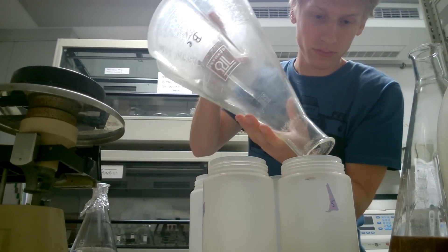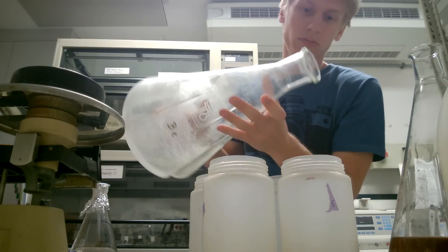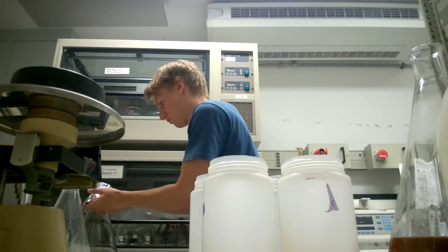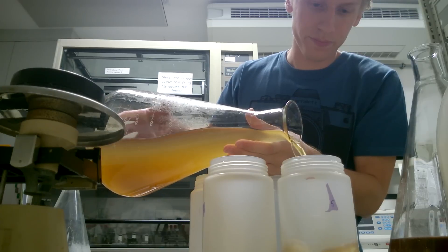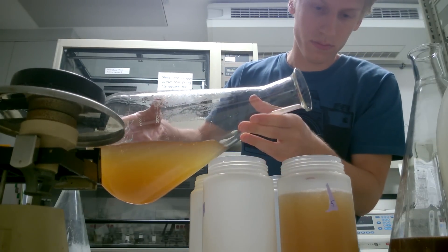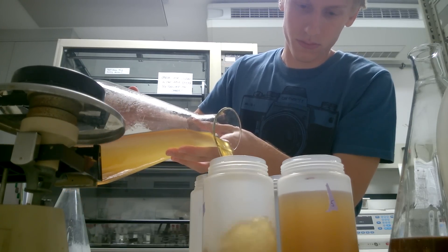That is the last little bit of culture from that flask. It was actually six flasks — it's been a week since I recorded that so I don't quite remember. You can see it's still really opaque; all the cells are still swimming in the solution until they get spun down in the centrifuge. I don't need to fill the cups completely because I don't have that much left.